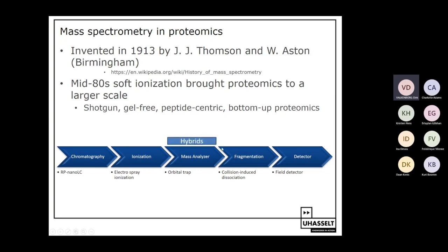And do note, there are a lot of hybrid mass analyzers today. For each blue block, there are maybe 10 competing technologies that have 10 different characteristics and will lead to different types of data sets. So if you think after this series that you know everything about proteomics, you're wrong. You just know one particular flavor of technology in the context of shotgun proteomics or bottom-up proteomics.